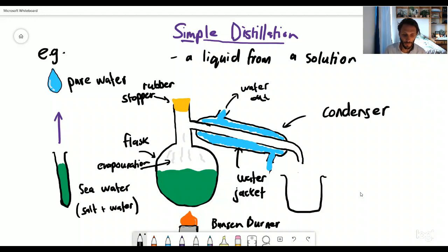Water is going to evaporate. And the pressure that builds up inside this flask is going to force this vapor to flow down this tube. Now, as soon as it gets into this condenser, it's going to do exactly that. It's going to condense the water as a gas back into a liquid.